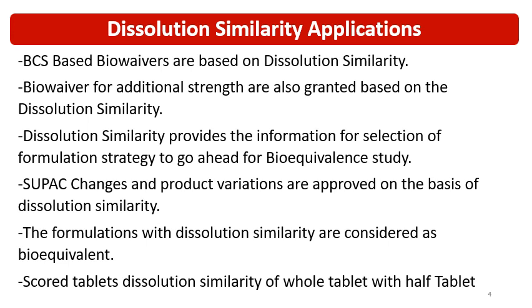So dissolution is the key performance test. Then SUPAC changes and product variations, whether you are varying the composition, manufacturing process or site, are approved on the basis of dissolution similarity. Formulations with dissolution similarity are considered bioequivalent.